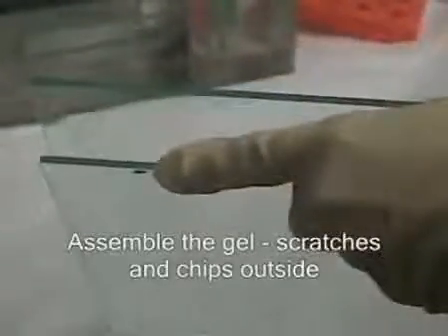So when I assemble the gel, I will put that chip on the outside of the gel. So the gel will be in between these two pieces of glass, and the chip will be on the outside, and it won't affect the gel in between.